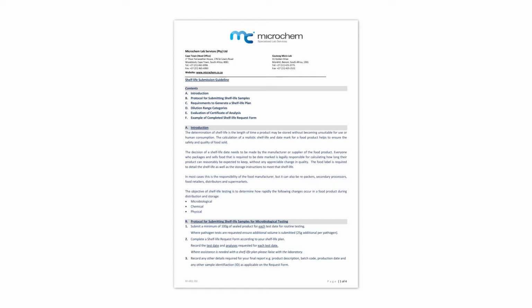The protocol for submitting shelf life samples for microbiological testing is as follows. You need to submit a minimum of 100 grams of sealed product for each test date for routine testing. Where pathogen tests are requested, ensure additional volume is submitted, 25 grams per pathogen. Complete a shelf life request form according to your shelf life plan. Record the test date and analysis requested for each test date.